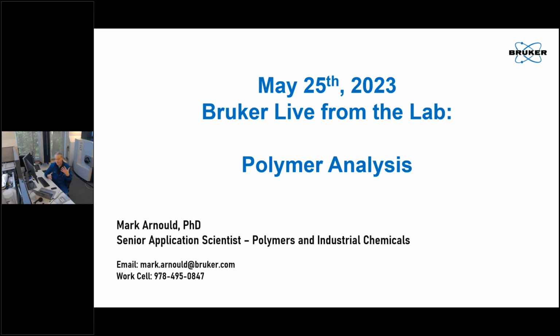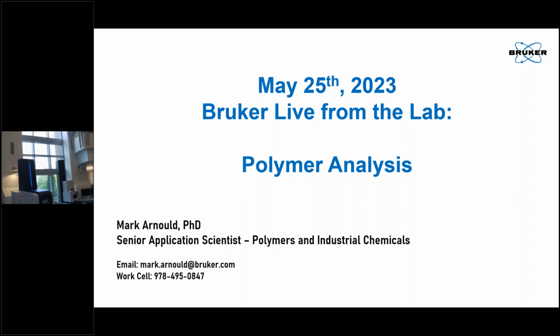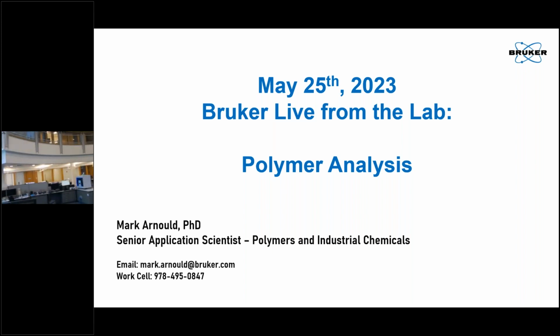So before I get started, we are coming from Billerica here in our demo lab. So a quick scan of the lab, if I can get the camera to work. So right now I'm sitting at the table for the Autoflex, which is behind me, the Autoflex Max, flanked by a timsTOF Flex. And if we go, so here we see some timsTOF and impact.